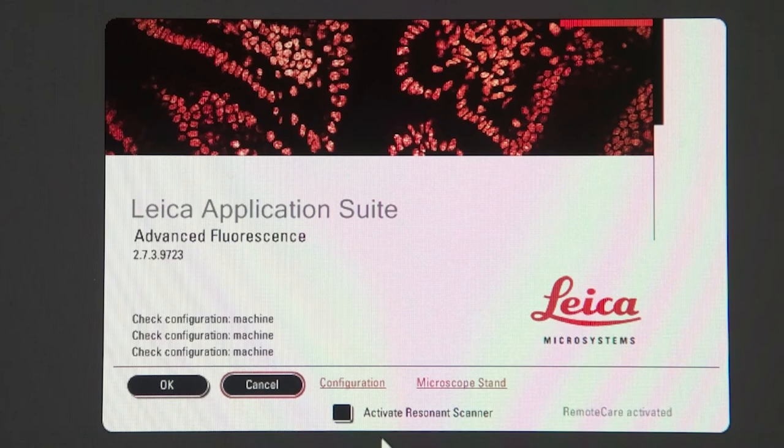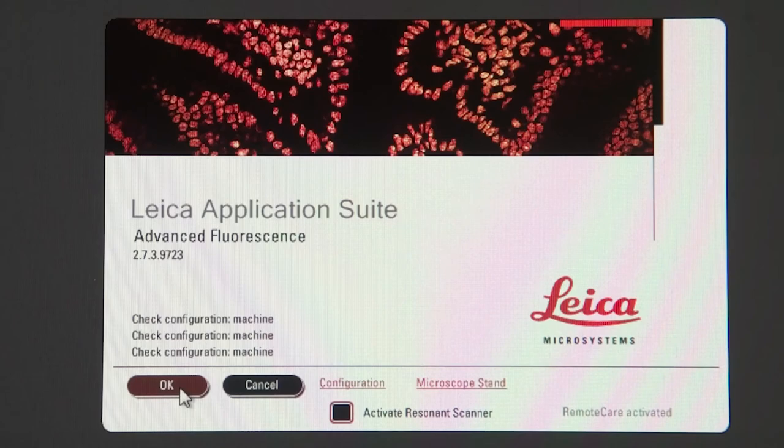Last, take a look at the activate resonant scanner. The resonant scanner is an ultra fast scanner that's used for live cells. We don't want to use it. If it's checked like this, make sure to uncheck it. Now once you've looked at all three of those things it's okay to go ahead and hit the okay button and keep going.